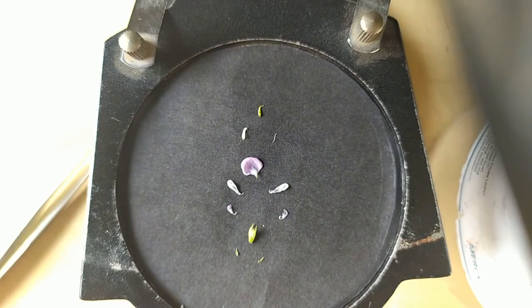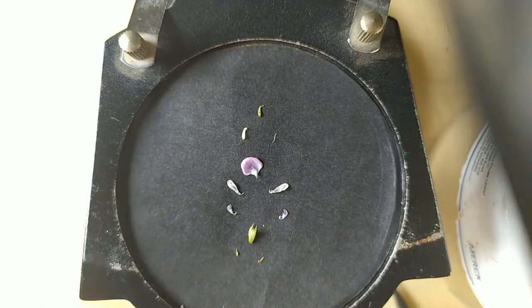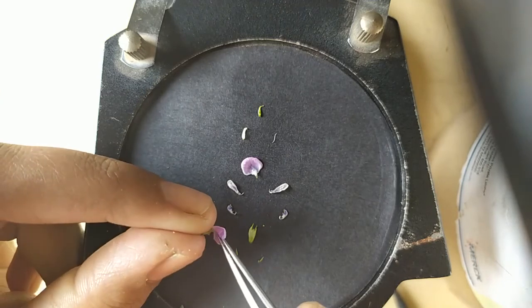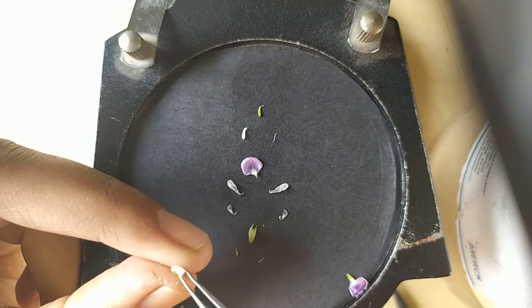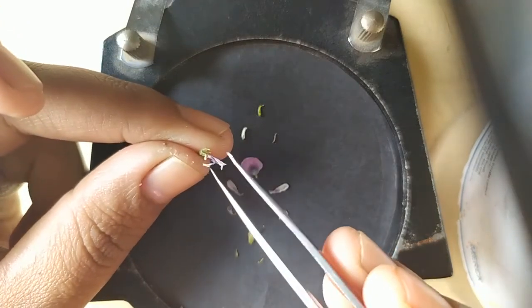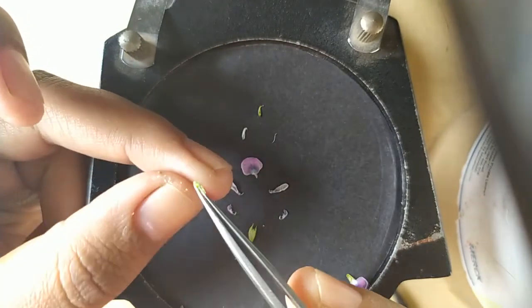Now this is the dissection of soybean flower. It is so easy. Simply you have to remove the standard, then the wings, and then the keels.